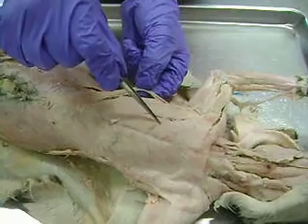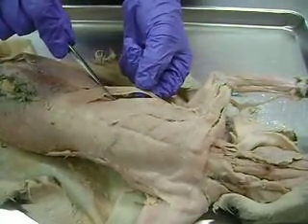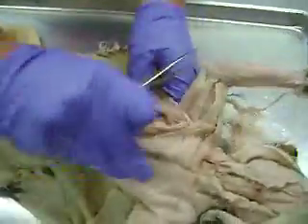So those are the superficial muscles in the chest: pectoantibrachialis, pectoralis major, pectoralis minor, and xiphihumeralis.